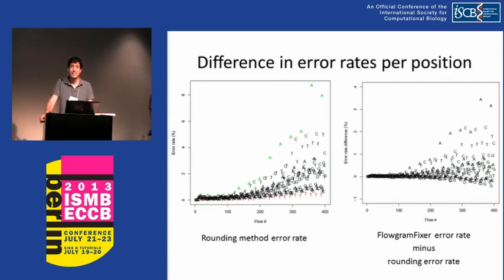So after your correction, did the read length change or not? They did grow a bit. You did not report. You just say you had more reads mapped compared to the 454. It's a good point. We were struggling with that; there's a bunch of metrics for measuring performance. Do you have any idea about how many bases, what percentage you shorten for each read?